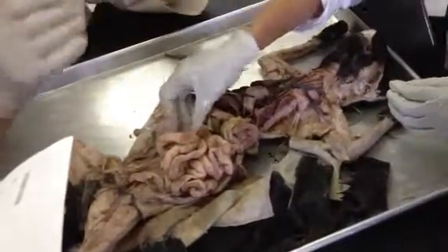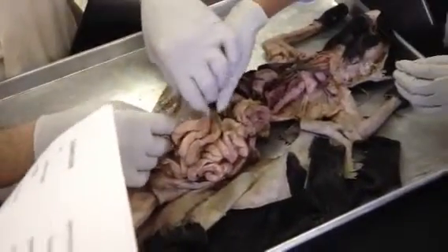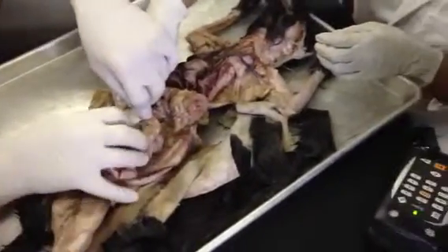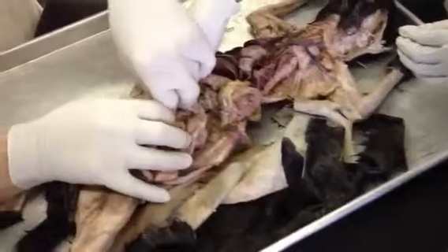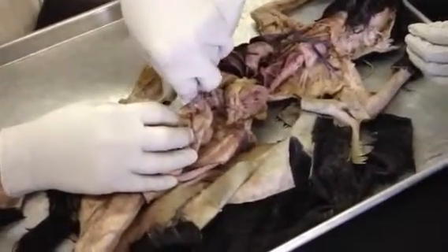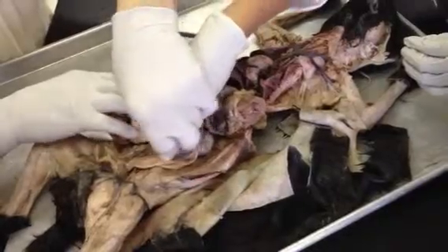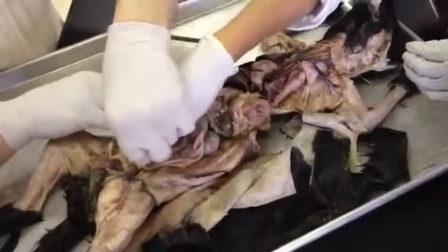Then we have the rest of the large intestine, and it runs, let me trace your finger along it. It's shorter than in a human. It just runs right up, bends around, and heads toward the anus. This part right here is the rectum.